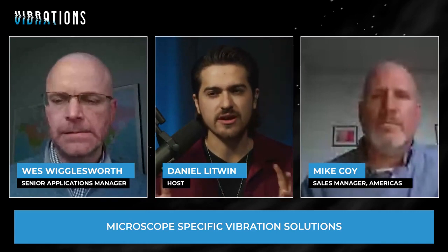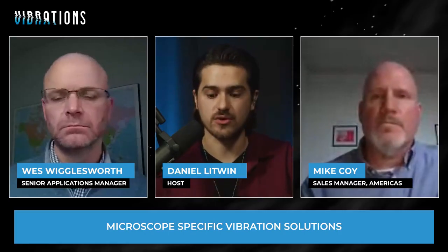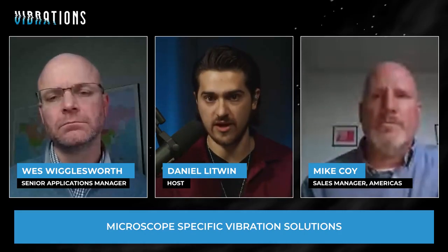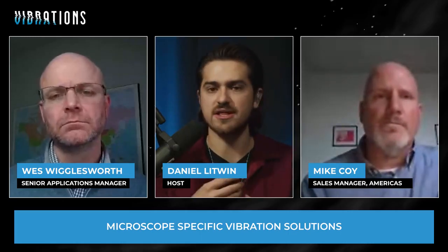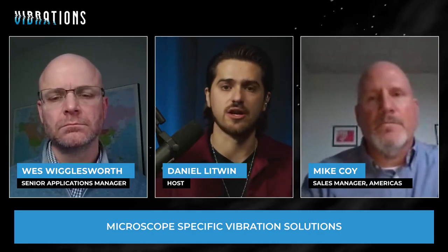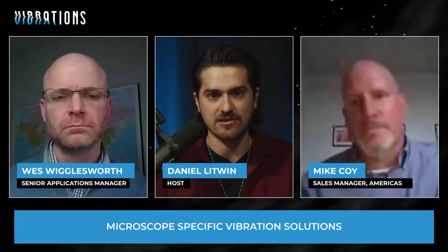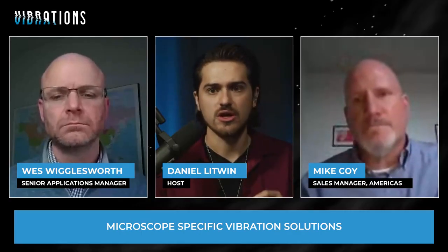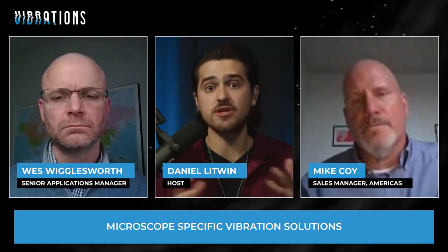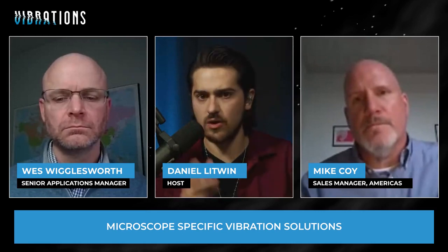So I'm curious if y'all ever run into microscope manufacturers typically having some kind of specification for floor vibration, right? Do you ever run into that where the manufacturers themselves give direction on, here is your microscope, we typically recommend this kind of vibration solution, or meeting this kind of criteria or specification? Or is it much more custom and non-standard? What do y'all see?